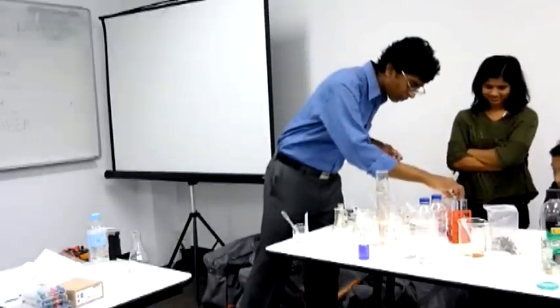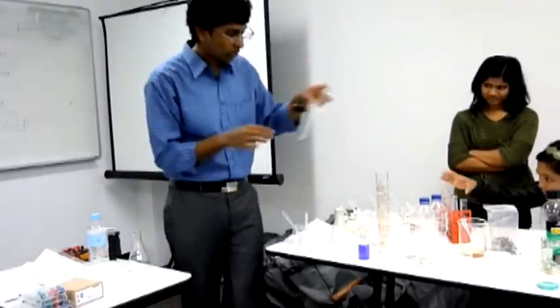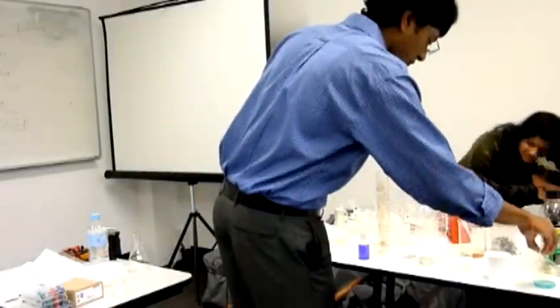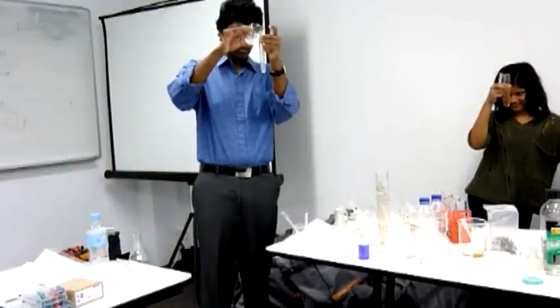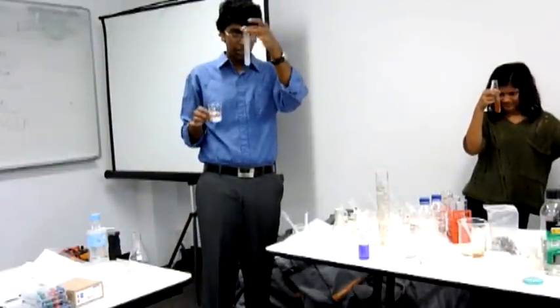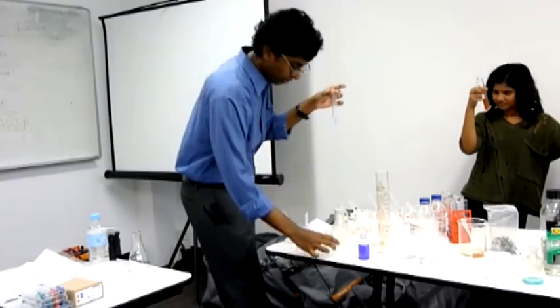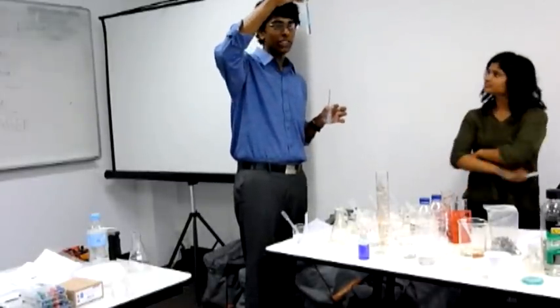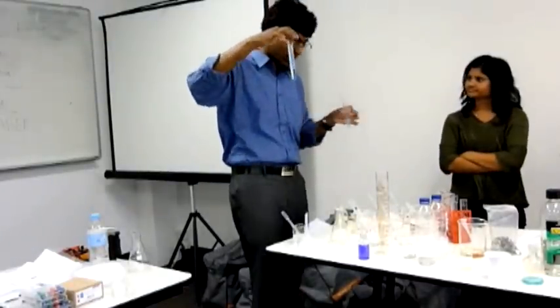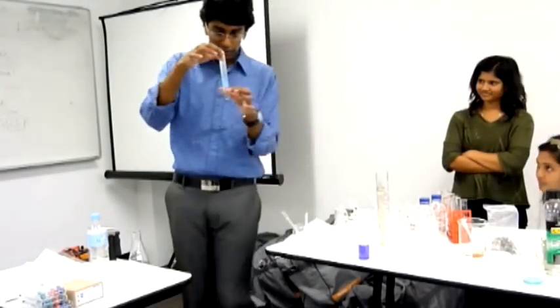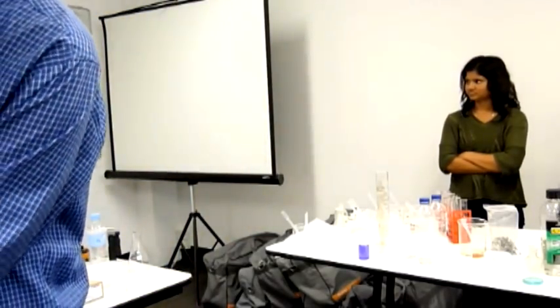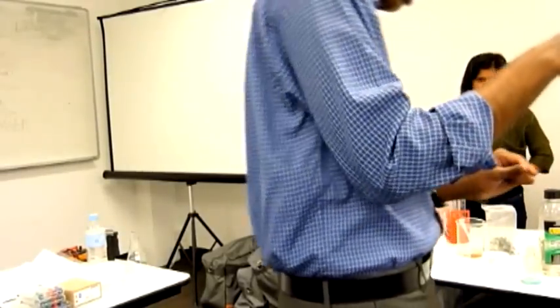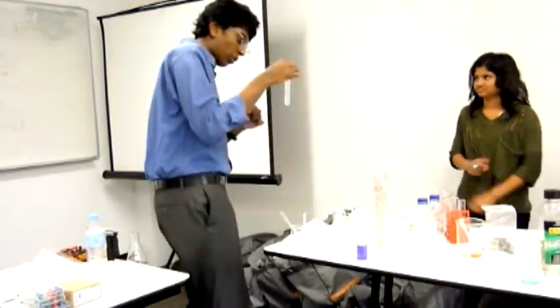It should go deep. Hold on, we'll try it with a fresh sample. This one played out the last time ago. Not really. Can you see the blueness, the deep blue solution, sort of the solution trying to form? Precipitate hasn't dissolved from our deep blue solution yet. But can you kind of see the difference between what we had before, a very clear cloudiness, but sort of what's going on up here now, with the clearness of the solution? Okay, it's getting dark. I think to get the deep blue solution, we'd have to add a lot more ammonia.